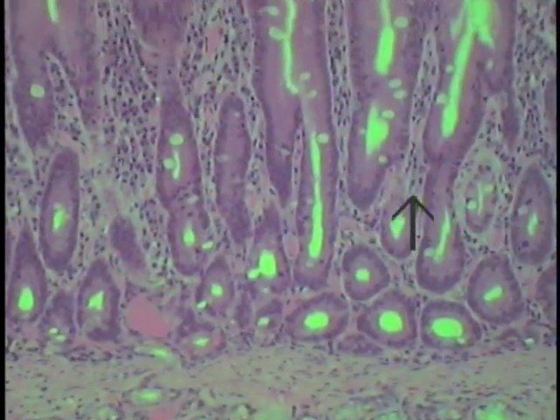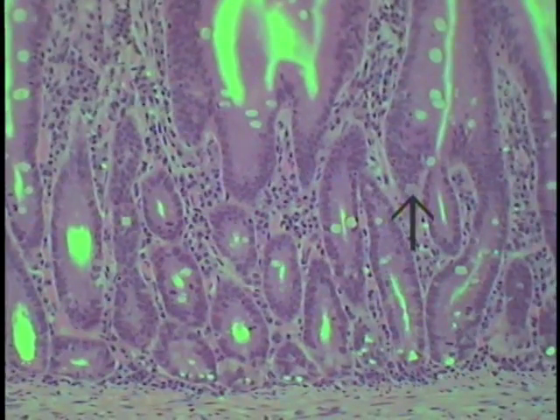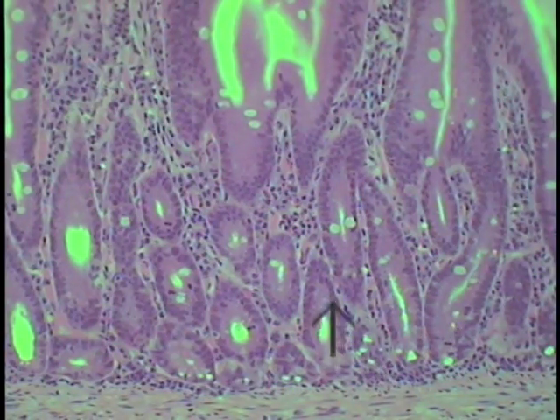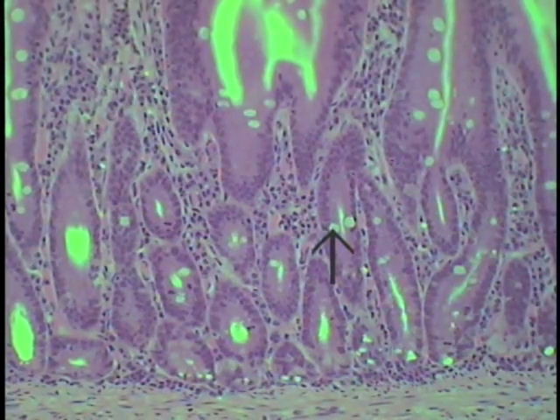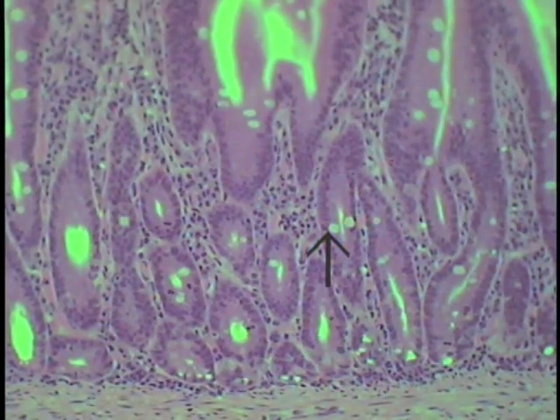Now, having confirmed these observations, proceed and examine the epithelium at higher magnification of some of the intestinal glands and look for additional cell types, namely goblet cells, which can be seen here, and in particular the enteroendocrine cells. Although there are probably 15 to 17 different types of enteroendocrine cell, at least the general form can be recognized on this particular plastic section. So please identify some of these cells.